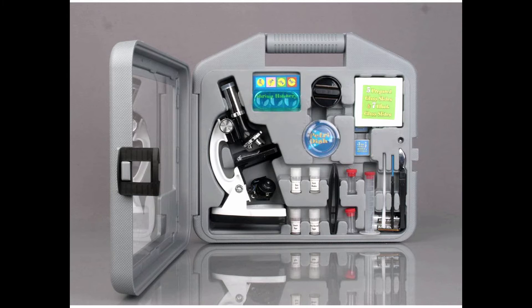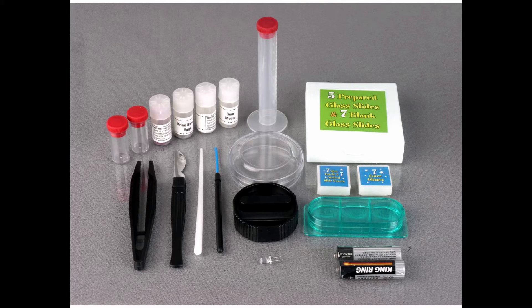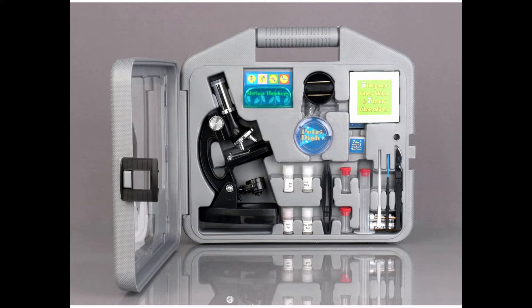240x, 300x, 480x, 600x and 1200x, a single coaxial coarse focus knob, a specimen stage with two built-in stage clips, and a natural light and/or LED illumination system. It can be illuminated with either natural light through a mirror or by the built-in LED light that provides direct control of light. The microscope has a durable metal arm that makes it a great value.